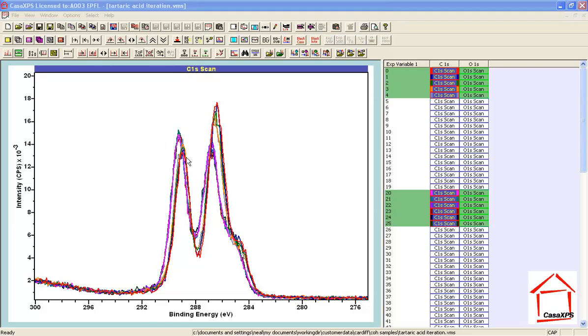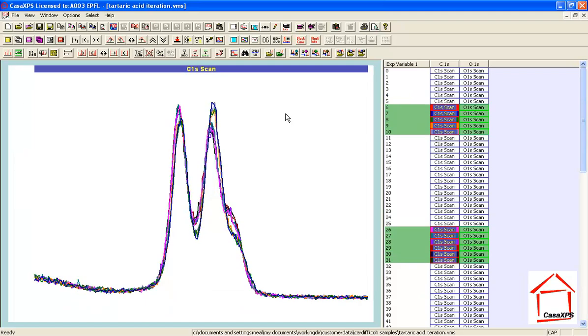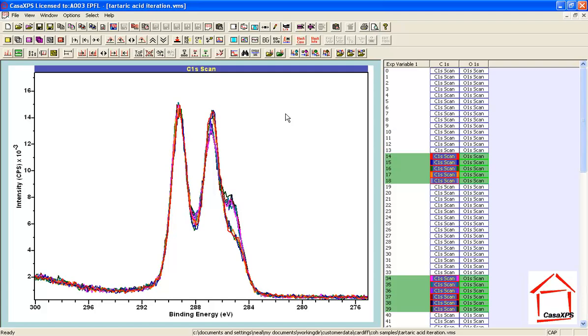The offsets between these two groups of spectra are related to the initial phase of this measurement. If I start stepping down the spectra, then a point is reached at which the alignment seems to be very good. The shapes are changing, but the alignment of the peaks that we can see seem to be quite good.